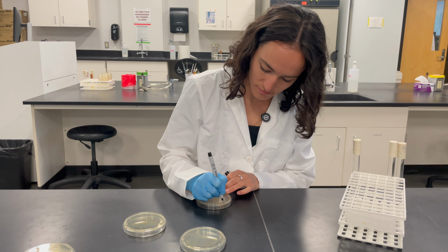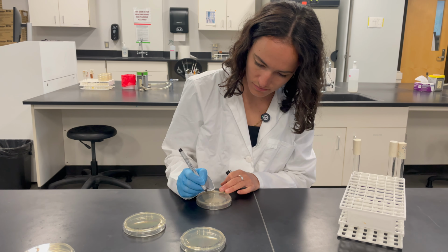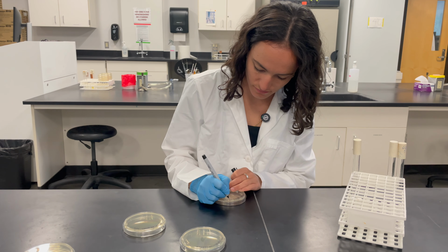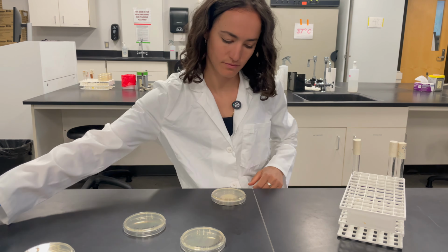First things first, we always label our cultures with the important information, like your initials, date, and identification of the microbe or sample. For example, mouth is sufficient for the mouth culture. Pro tip, always label the bottom of the petri dish, the part that actually holds the media. That way, there's always a label attached to your culture. If you label the lids, for example, there's a chance that things could get swapped just due to human error.